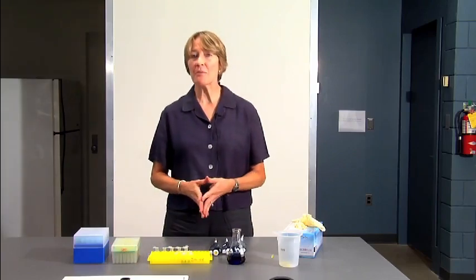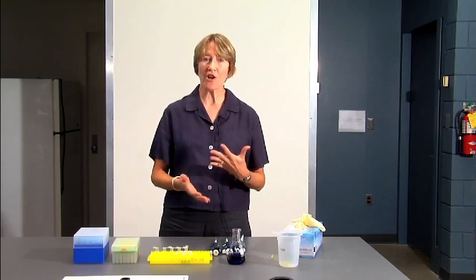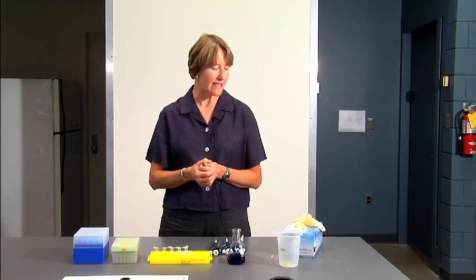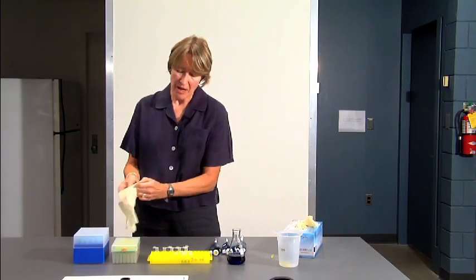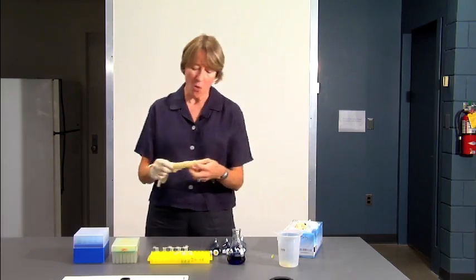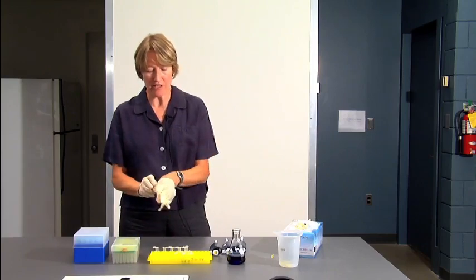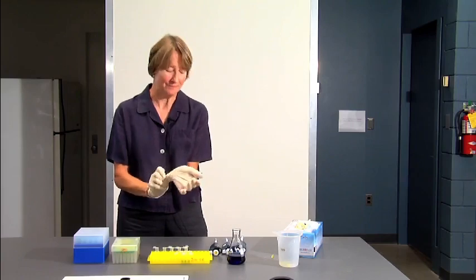In lab, because we're going to be using DNA, we don't want to contaminate our samples with anything on our hands. Sometimes your hands have DNases and RNases, which could destroy nucleic acids. So we're going to wear gloves to do our pipetting. And you should always wear gloves if you're using anything toxic or any microbiologicals, such as bacteria or viruses, because you don't want to contaminate yourself or the sample.